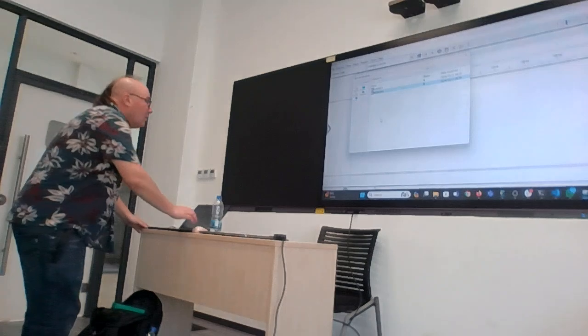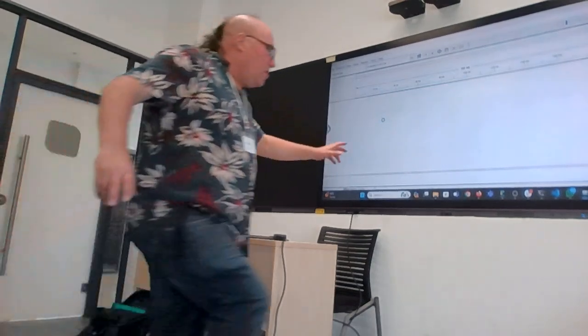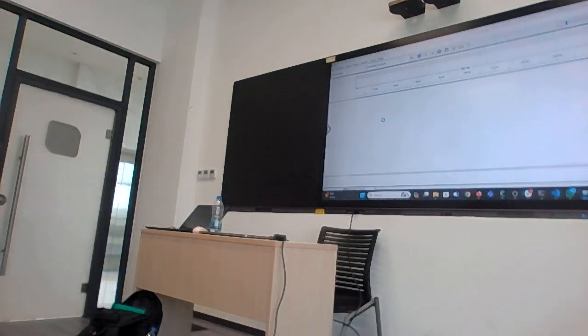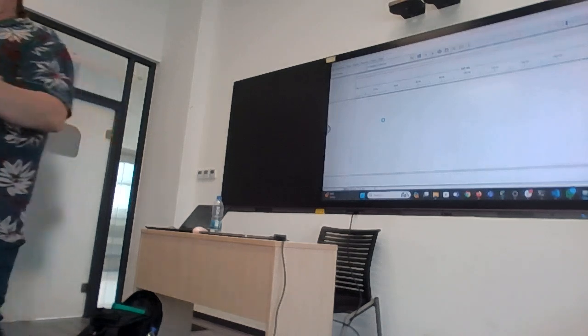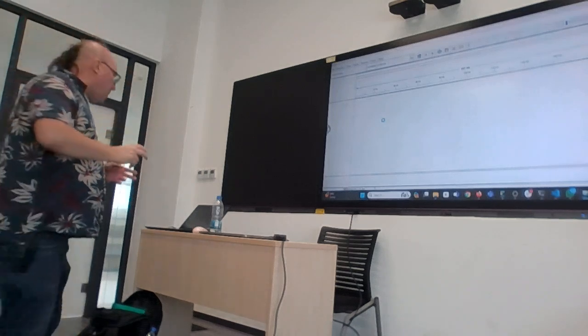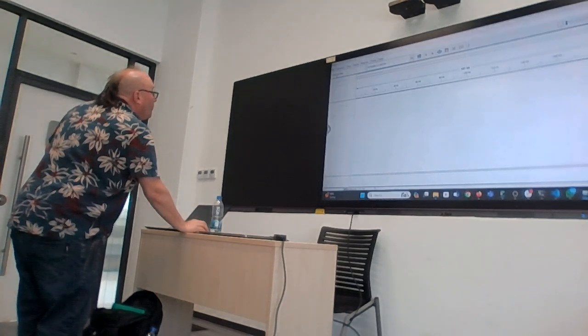Okay. So I'm going to load the genome. And I can see nothing, but it shows MT903 here in the corner. Now I need to load the reads. The reads are in a format called binary alignment, BAM. Okay, like bam, bam, bam. If I need to find the reads, file, load from file.